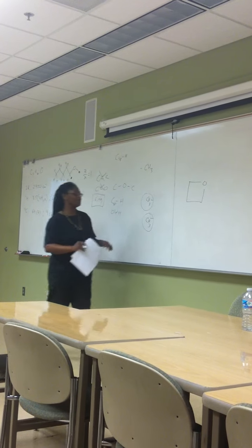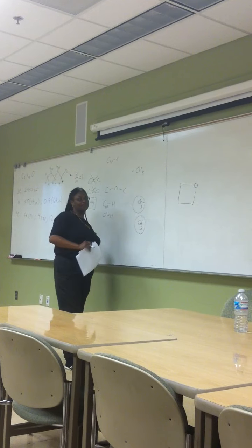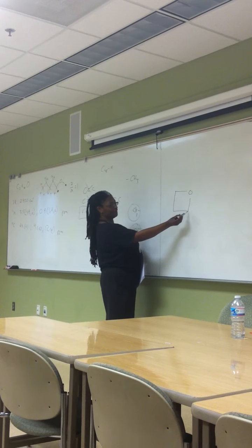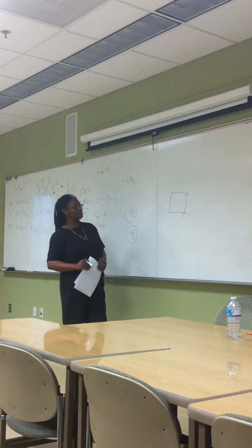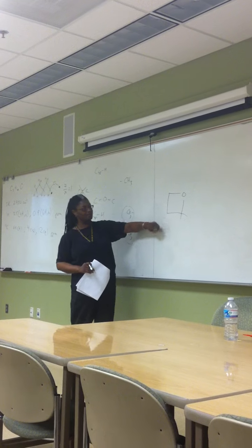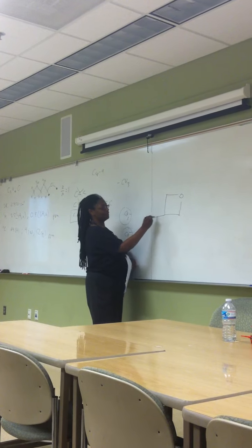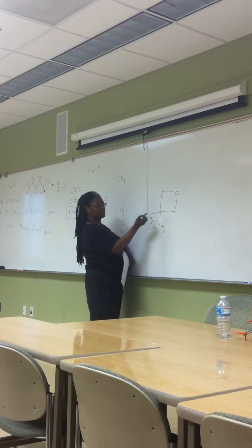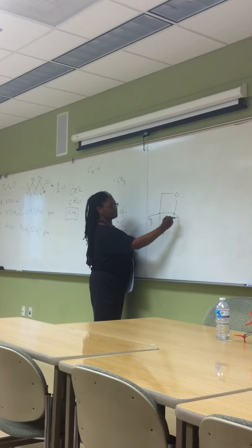And now we just have to figure out where do we put the 2 methyls. They need to be equivalent, okay? So if we put 2 methyl groups there, they're equivalent, but then we would be generating 2 different types of protons here instead of 1. Okay, so the only place that those 2 methyls can go would be here. Okay, and see, this is a carbon with no protons on it, and then this one each has 2.